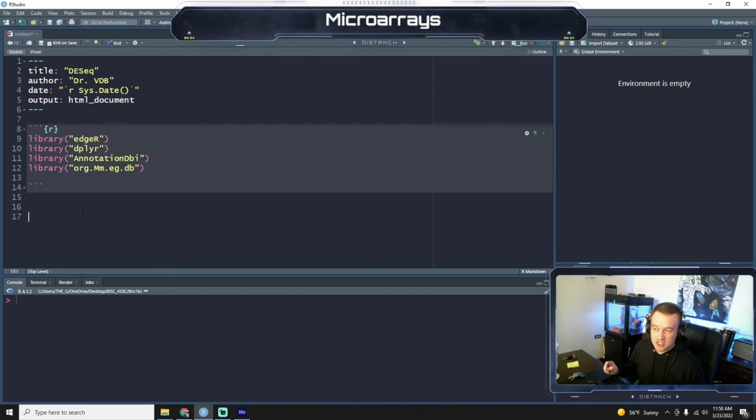Here we're going to be switching it up because I know y'all are probably sick of plants. As a plant researcher, I will admit plants can be boring to someone on the outside. So we're going to be doing mouse instead. There's not a lot of human spaceflight data because, since there's so few astronauts, there's privacy concerns about putting their genetic information out there for everyone to use. So we'll use the next best thing, which is mice, of which there's been a lot flown on the space station.